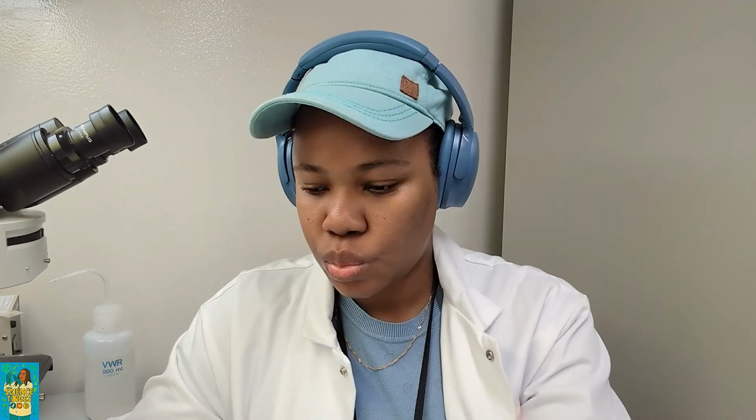So yes, I'm going to go put my soil in the water, have that stir for 20 minutes, and then come back to do the rest of it. I'll go do some other science stuff in the meanwhile.